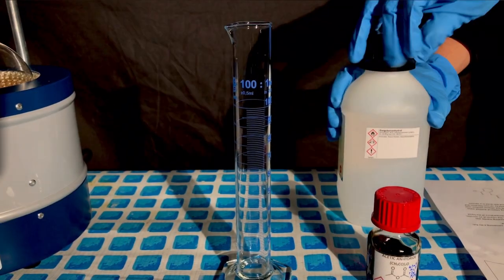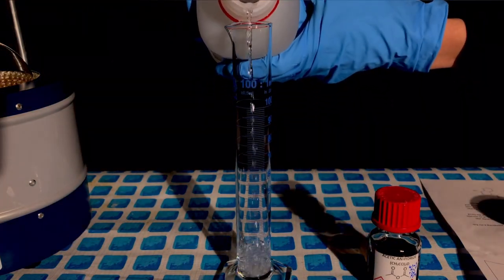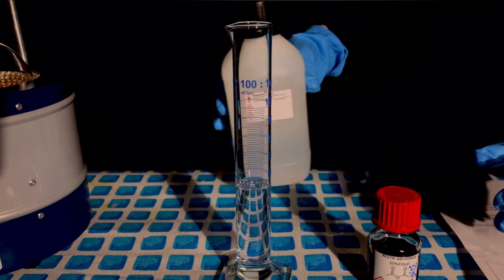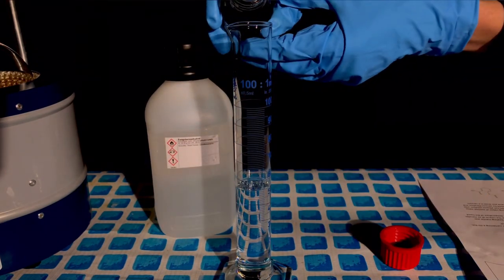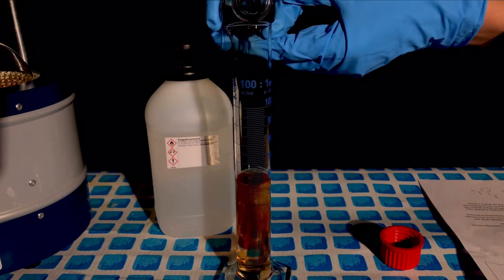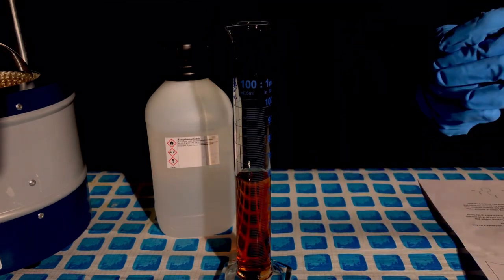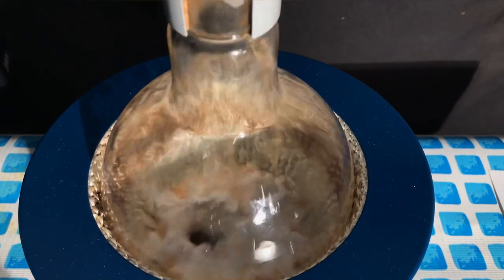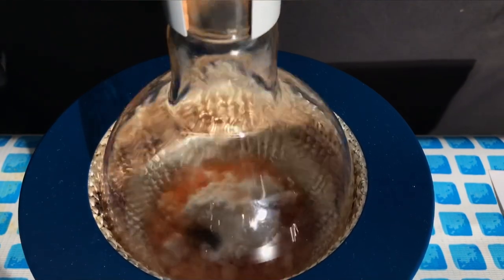Using a measuring cylinder, we measured out 55 milliliters of acetic anhydride and 5 milliliters of acetic anhydride containing 15% sulfuric acid. The sulfuric acid is required as a catalyst. Other acids might also be used, but I am unsure about that. After a stir fish had already been added, the acetic anhydride and catalyst mixture was transferred to the flask.